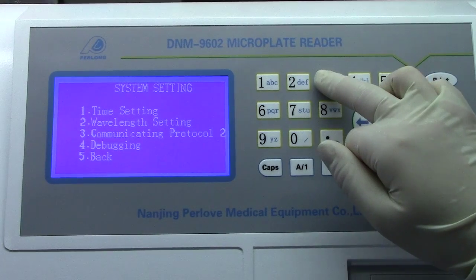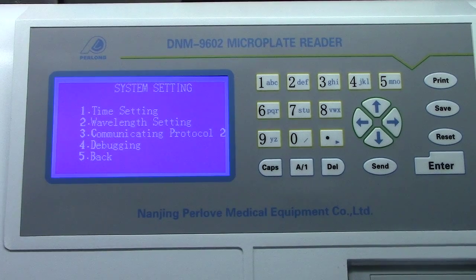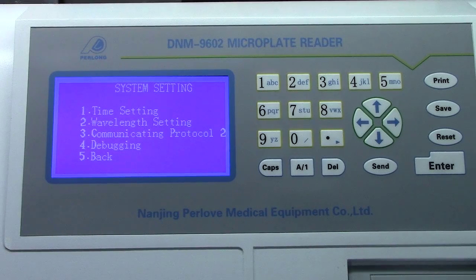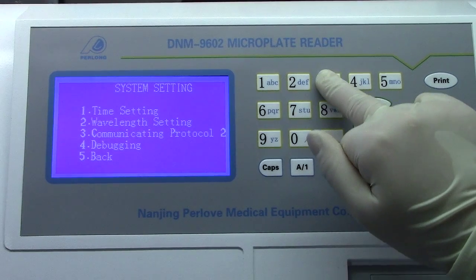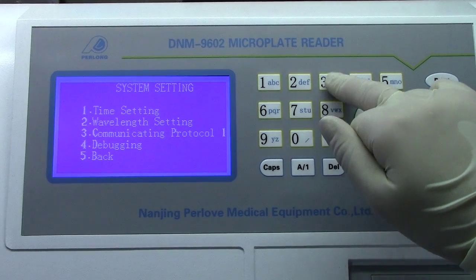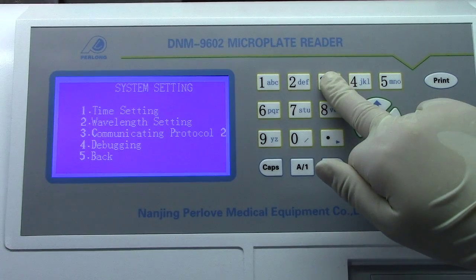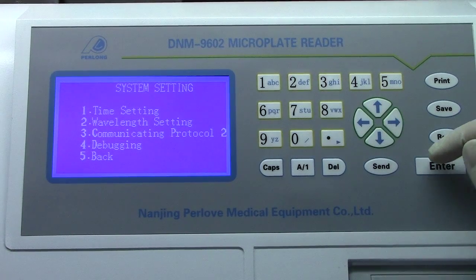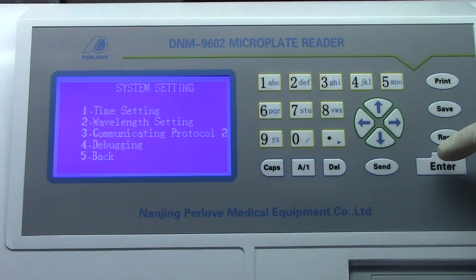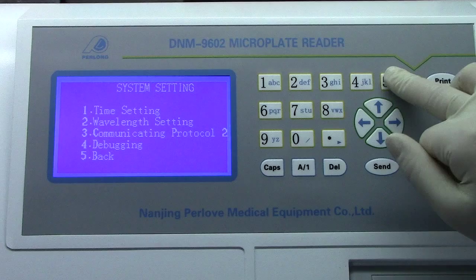Function 4 is debugging — also for our engineers, like function 2. Now let's check option 3: communicating protocol function. It has options 2 and 1; press 3 to change between them. We recommend clients to choose option 2. The system setting is now finished.